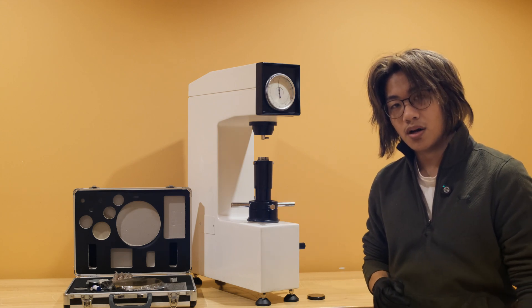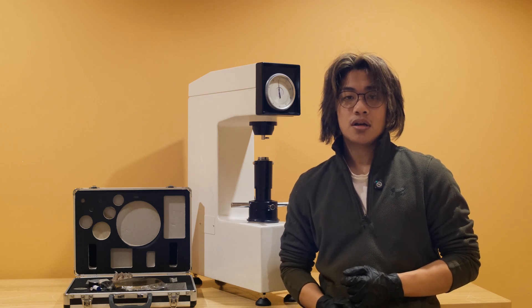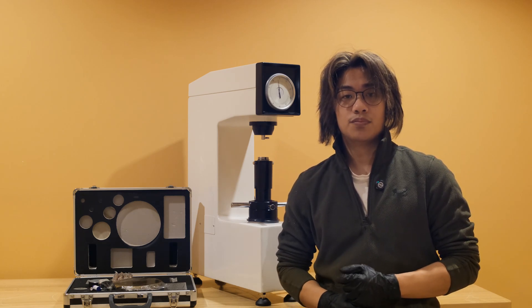The most prominent feature of this model is its very simple test cycle along with its cost-effective nature, making it one of our most popular benchtop superficial testers.